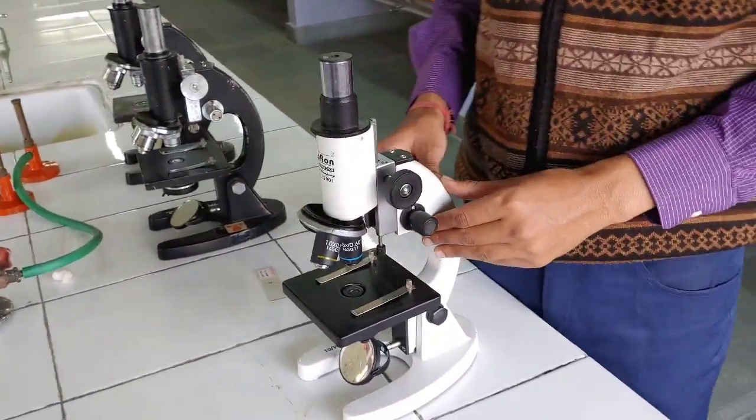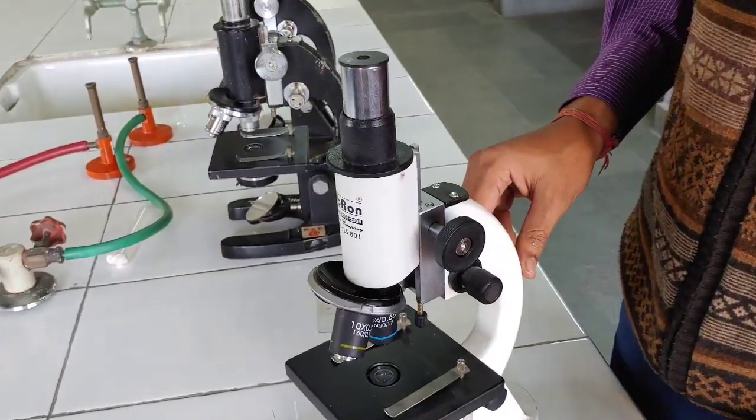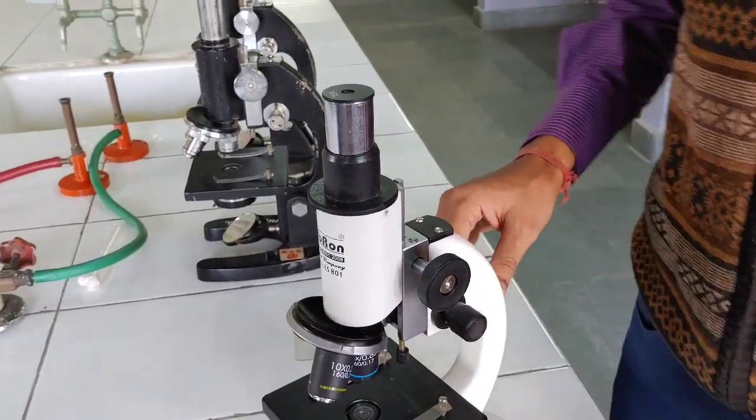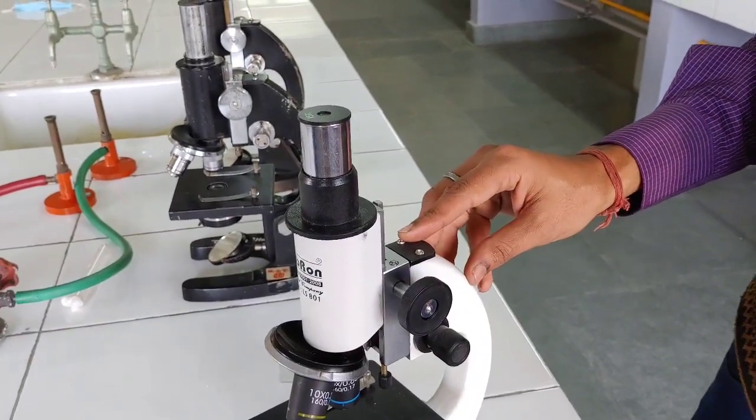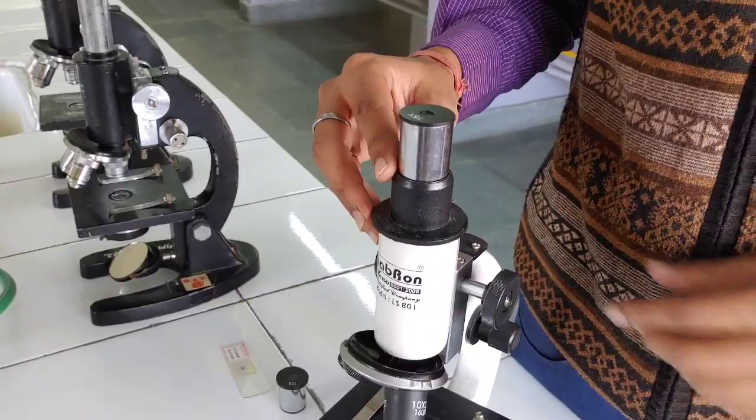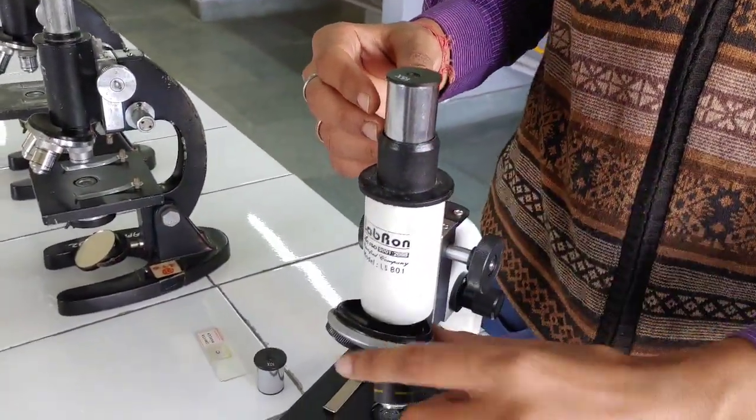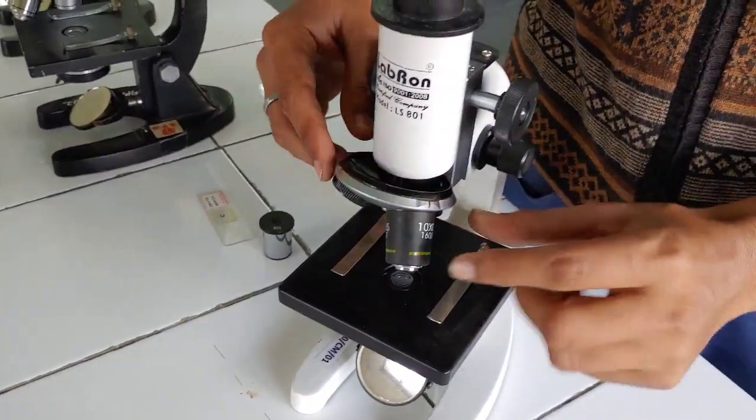Now what is compound microscope? You can see in this video that the compound microscopes consist of two sets of lenses. Remember this, that any compound microscope consists of two sets of lenses and objectives with higher magnification.